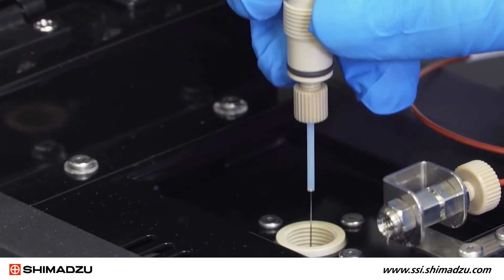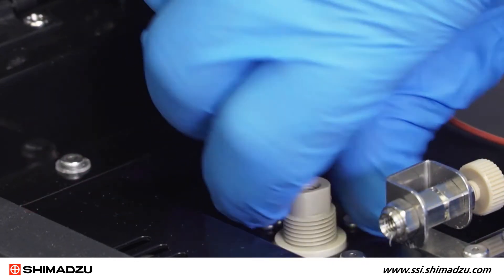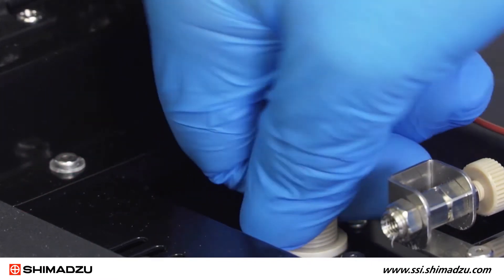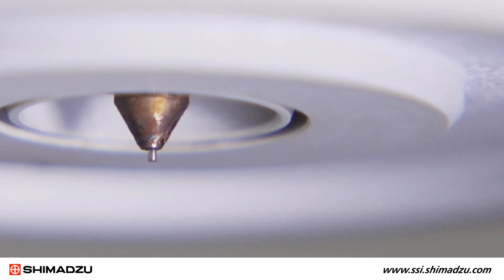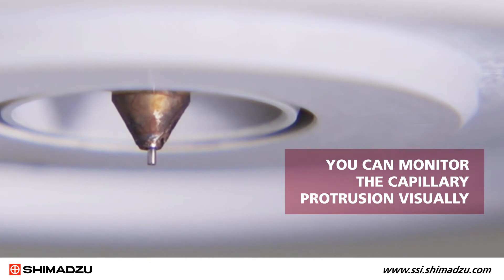The entire capillary assembly can now be carefully mounted back into the ESI probe. Be sure not to force the capillary down into the probe as that may cause damage. As you tighten the ESI coupling, you are causing the capillary to extend from the tip of the probe. You can monitor the capillary protrusion visually.